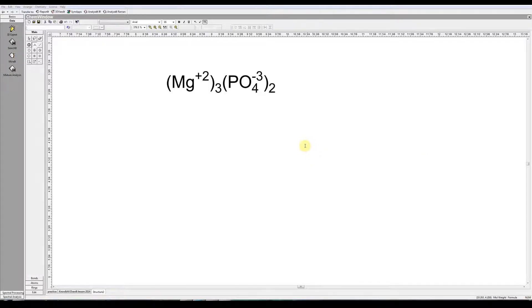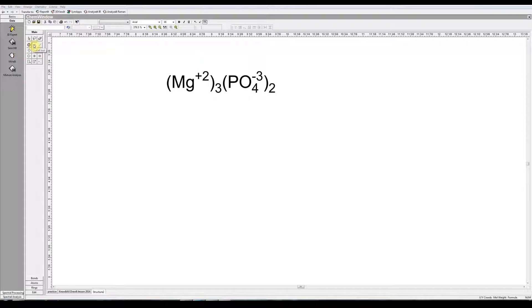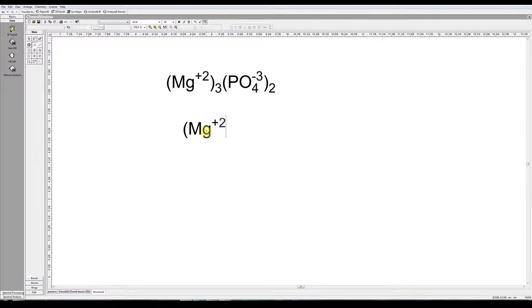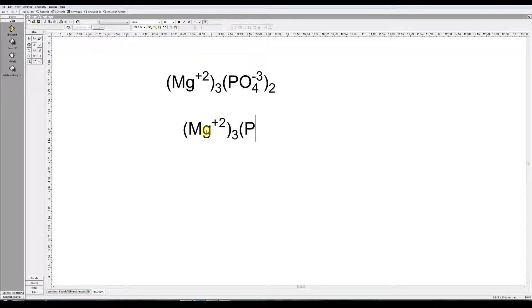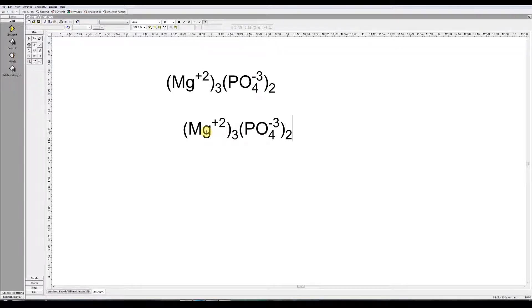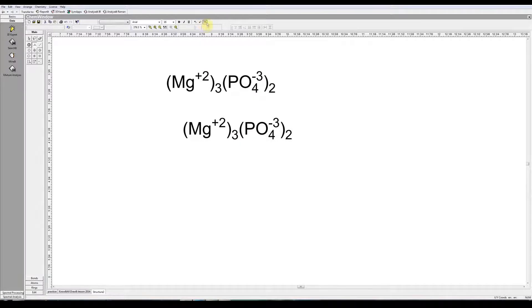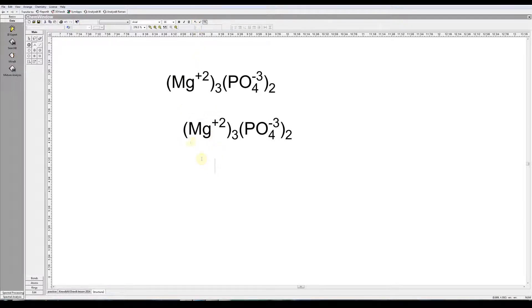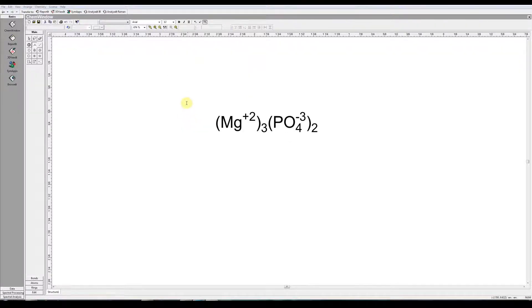Typing chemical formulas in Chem Windows is really easy. For example, I'm going to show you how we type this chemical formula. Simply choose the label tool here. The O with the bonds coming out of it. Click the canvas and just start typing. I'm not using any special characters. I'm not trying to subscript or superscript. Chem Windows seems to know just when. So as you type, it automatically subscripts and superscripts as required. And that's because by default it's in the formula mode.